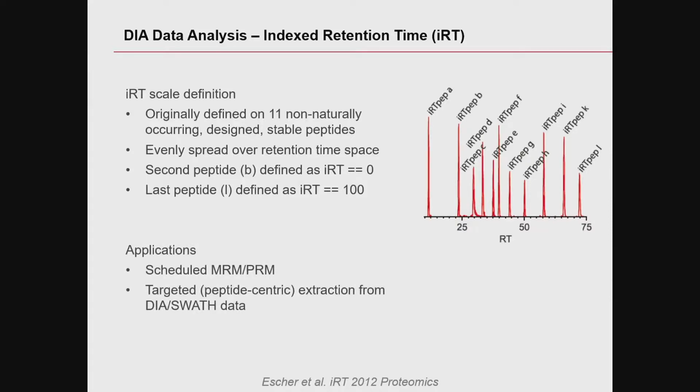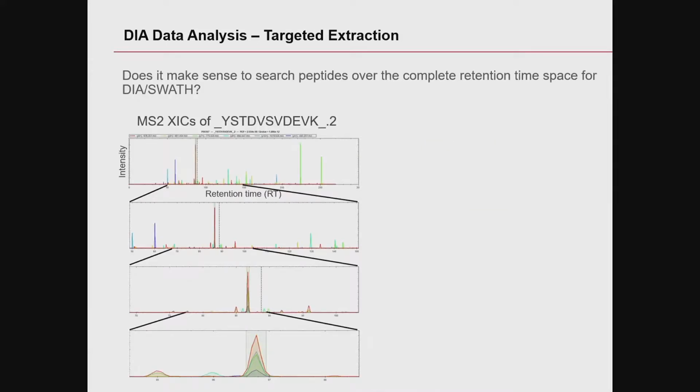The application in the beginning was actually scheduled MRM, but very soon it became clear that it can also be used for the targeted analysis of DIA data. And that's why I'm talking about it here today.